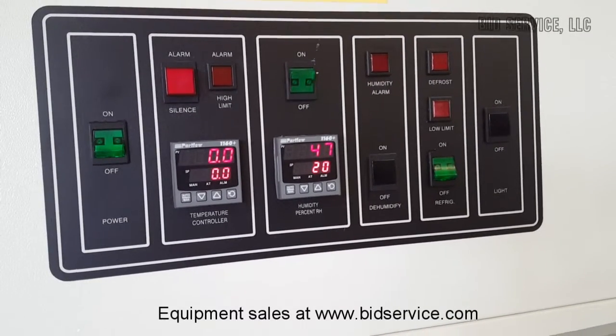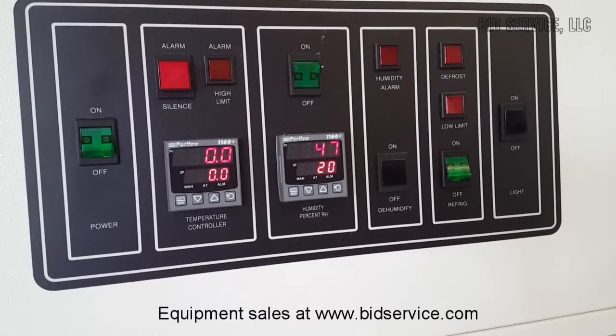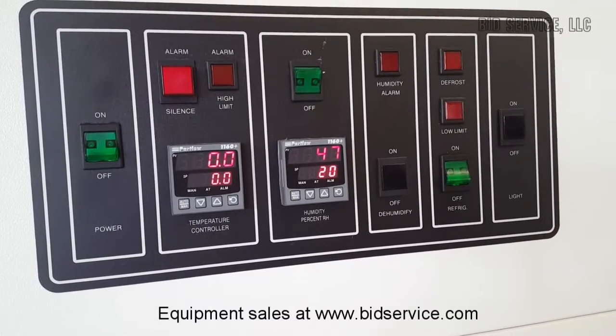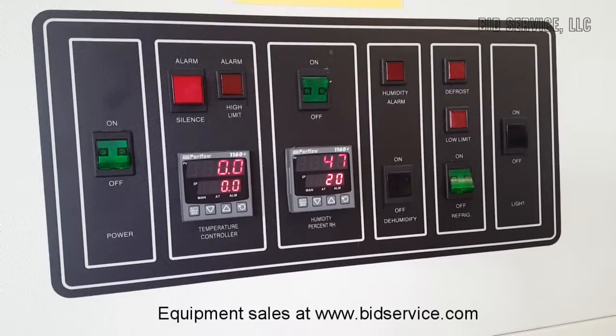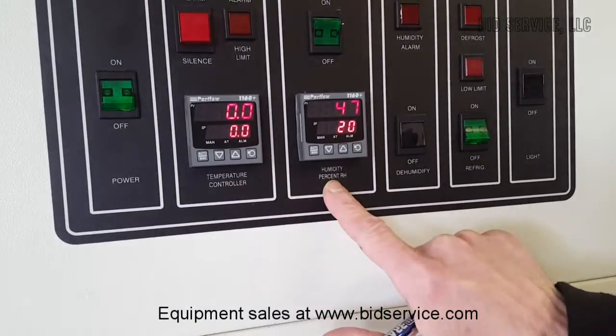This is the Lunair CEO 910-4 temperature and humidity test chamber. What we have here are two single set point controllers, one for temperature and one for humidity.